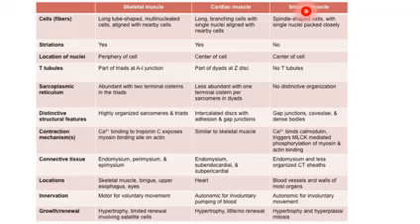And of course, this is just revision to what has been stated last semester in the general histology course. We should comment on the cells, I mean the fibers. Is it long, tubular, branching, and so on? We already stated that it's a long branching cell with a single nucleus, and this nucleus is central in position. And we do have striation, as the skeletal muscle contains striation, and the nuclei are central in position.